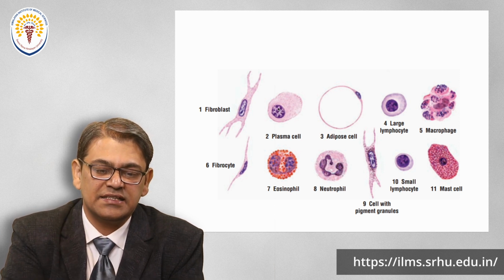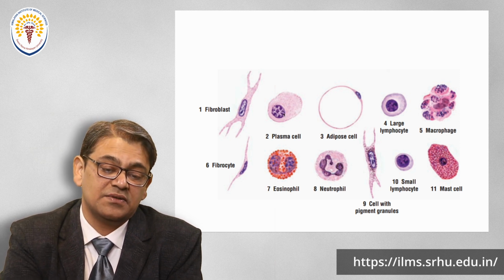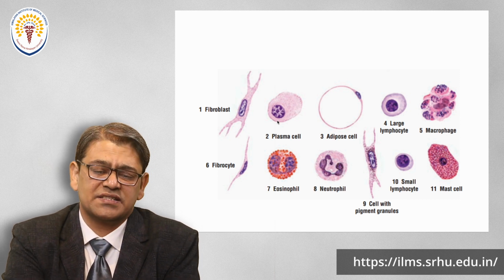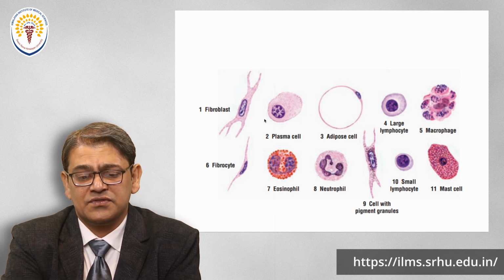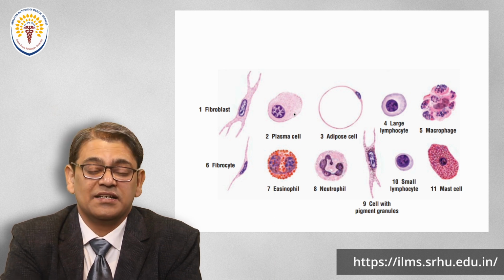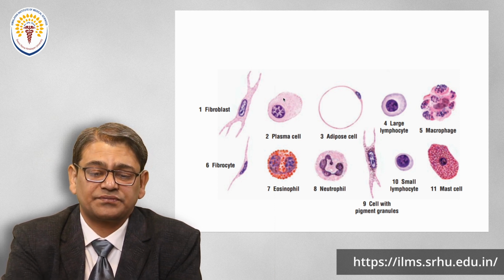Here we have this, and there are various spoke-like structures present here. It is named the cartwheel appearance of the plasma cell nucleus. It's a very commonly and clearly visible structure. Whenever you observe a histology slide of connective tissue, if you see this nucleus, in one go you can understand it's a plasma cell, and you will never forget in your life how a plasma cell looks.